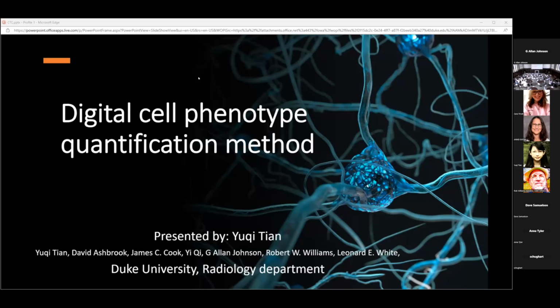I'm Yuqi from Duke Radiology, and I will present a method that offers a rapid and processed way to count cell phenotypes across various brain regions. And let's go ahead.